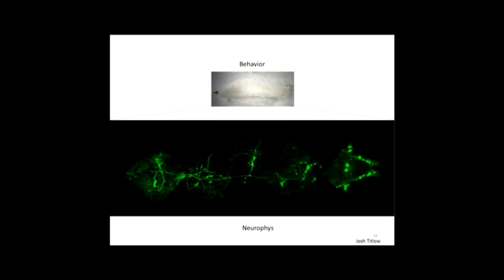So using this behavior test to investigate the responses that are happening in an outward manner, it's important to connect these outward responses to what's happening inside the larval nervous system. So moving from the behavioral test, now we can move into the neurophysiological test.